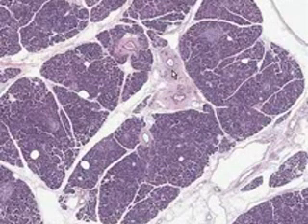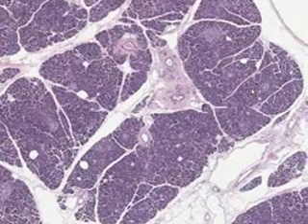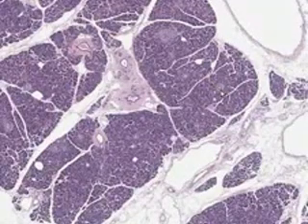Doesn't matter what you call it. But ducts which are outside of the lobules are surrounded by connective tissue. Ducts that are inside the lobule are surrounded by acini.